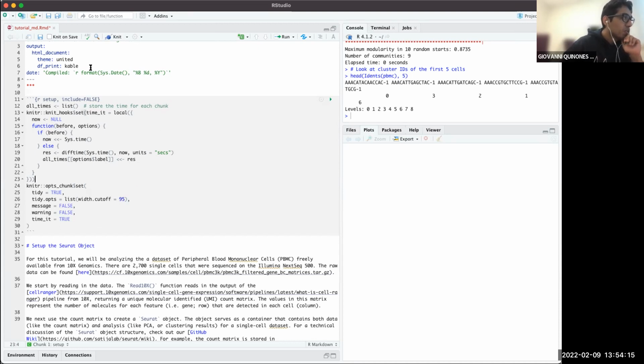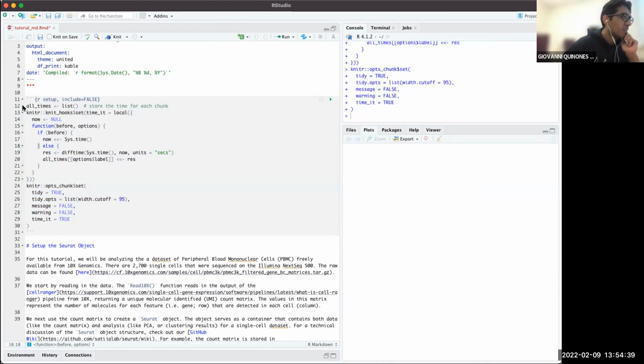So once you have loaded this notebook, you'll see this green arrow over here. This green arrow is going to run the code for this cell. These sections are called cells, and you can just go ahead and press it, and you'll get a green bar that shows the progress.